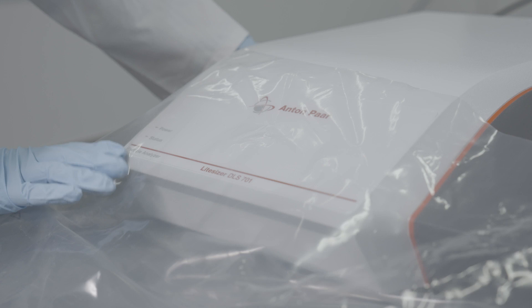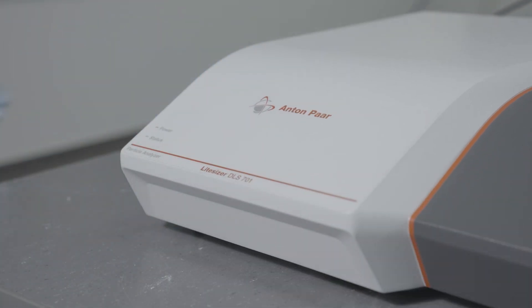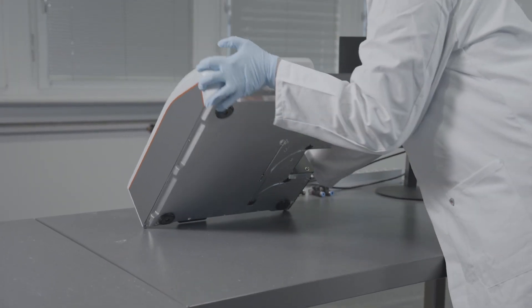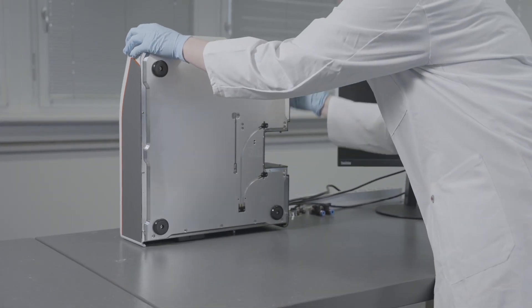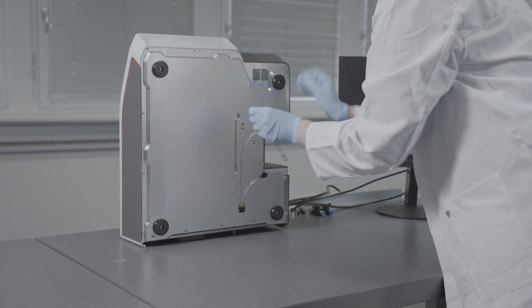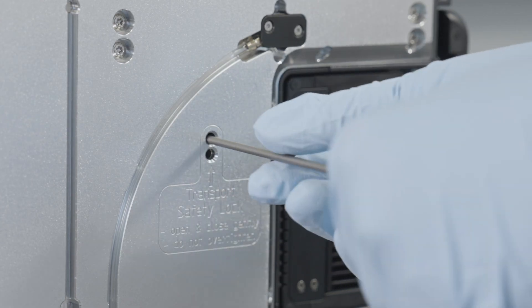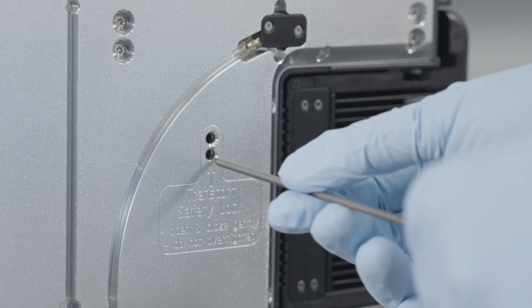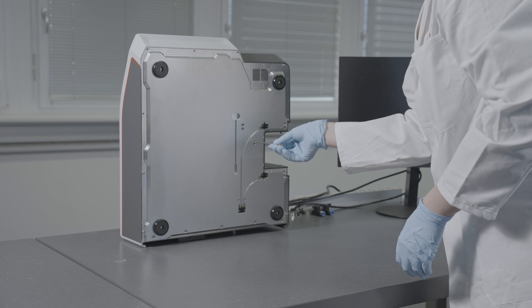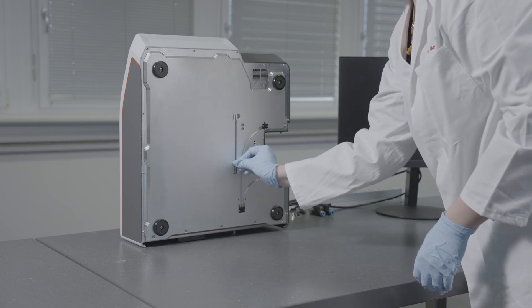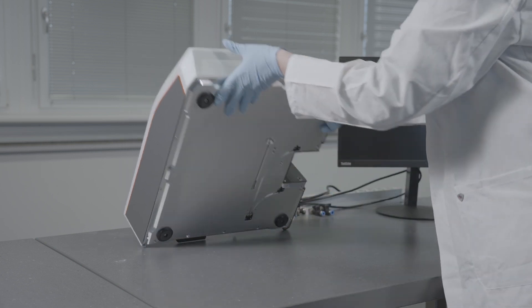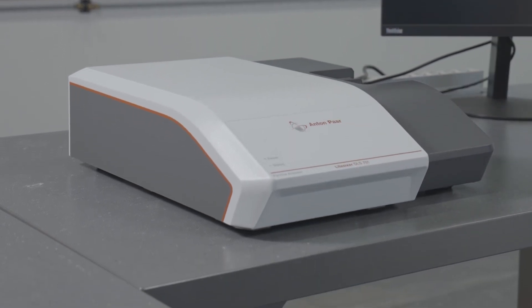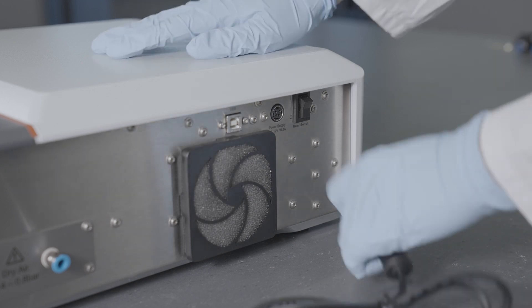The next important step is to open the transport lock. Lift up the instrument so that it stands on the back side and the bottom panel is visible. Use the supplied tool and insert it into the instrument, turn the screw counterclockwise until you feel resistance. Repeat this step for the second screw, then lower the instrument again.